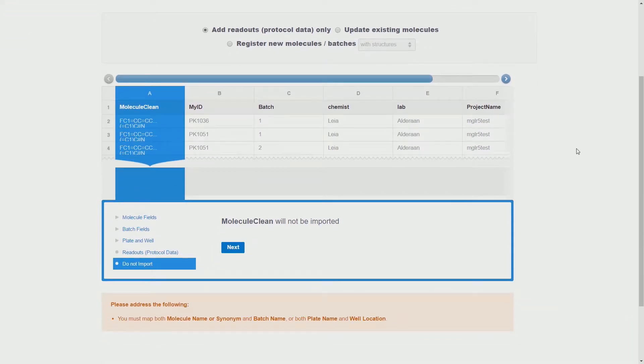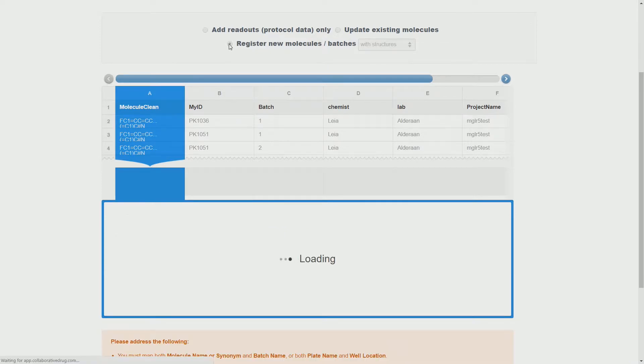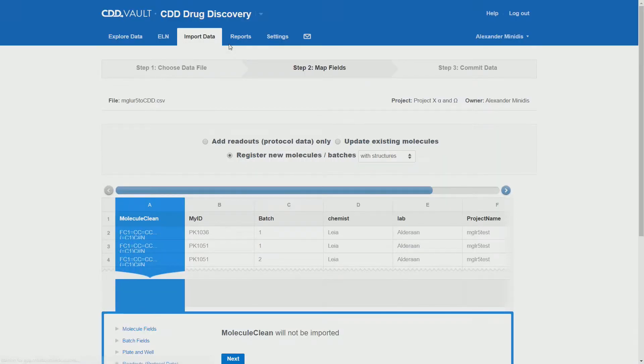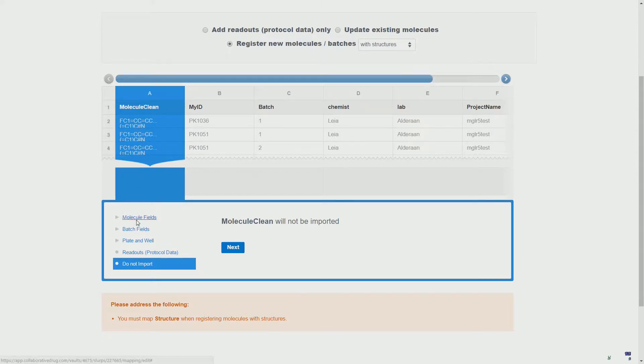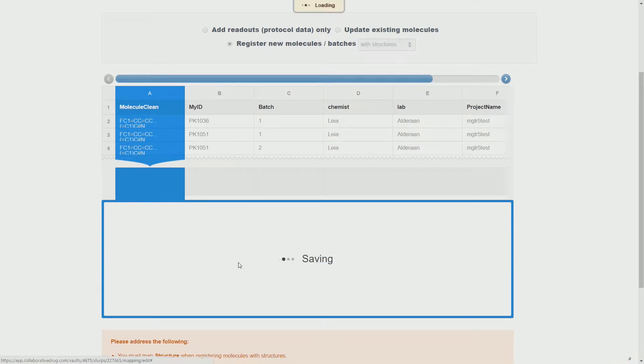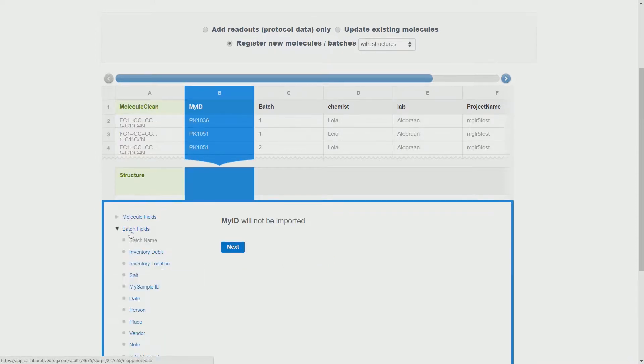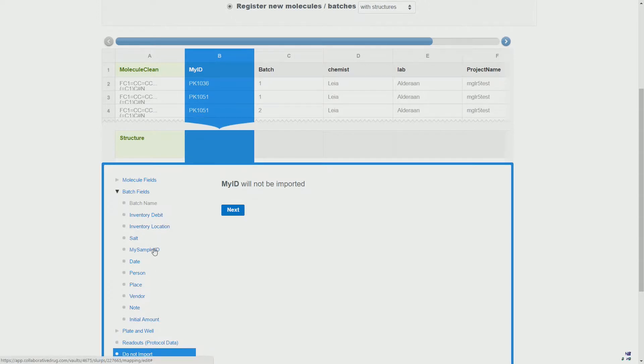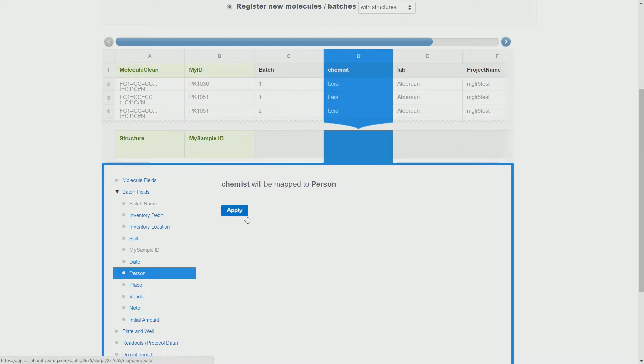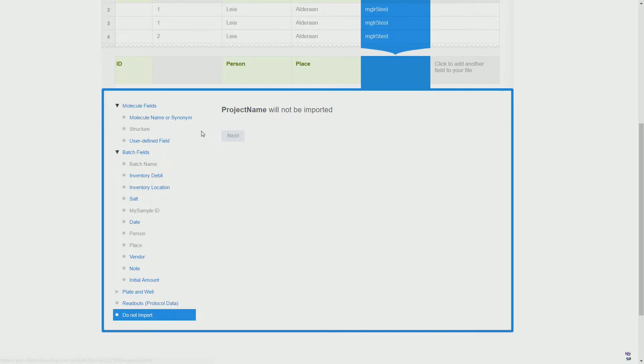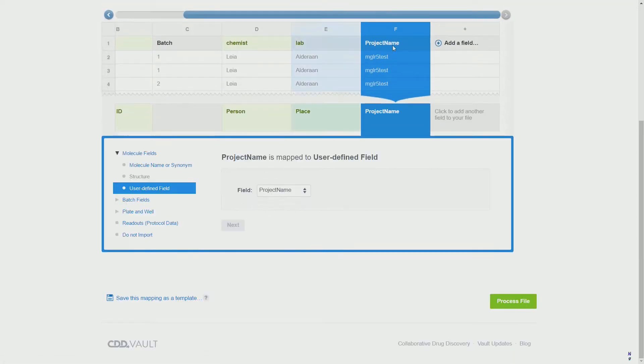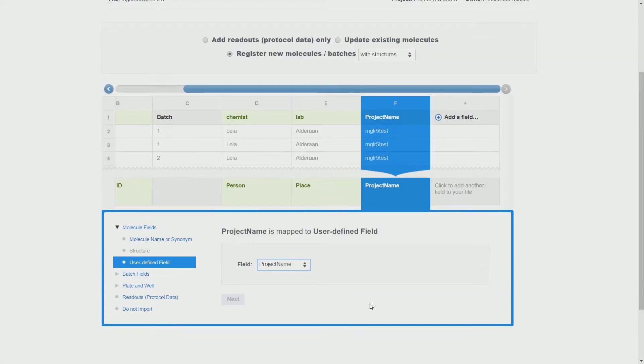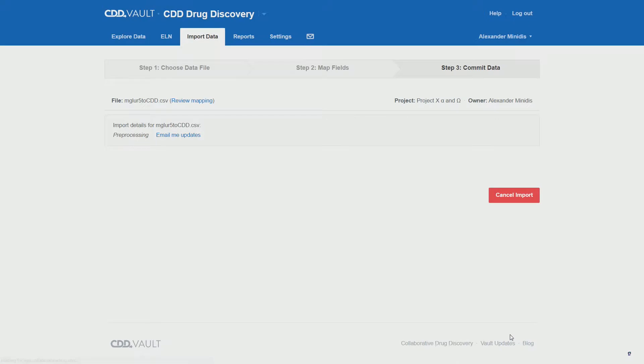Then we can check our imports and make sure that we are under register new molecules in this case. You will get a warning if you choose the wrong fields, so there's nothing really to worry about. Once we have done that, we assign the fields: start by the structure, then the ID, then the batch which in this case we can skip, and then we add any other fields that we might have in our import file. When we're done, we process the file.